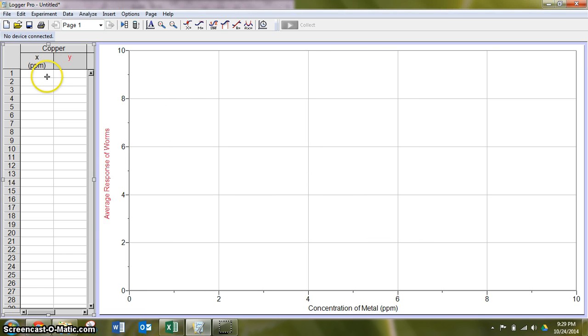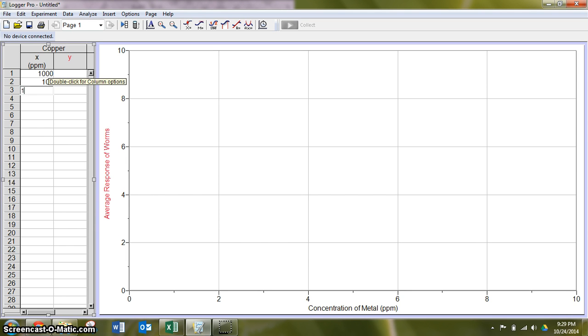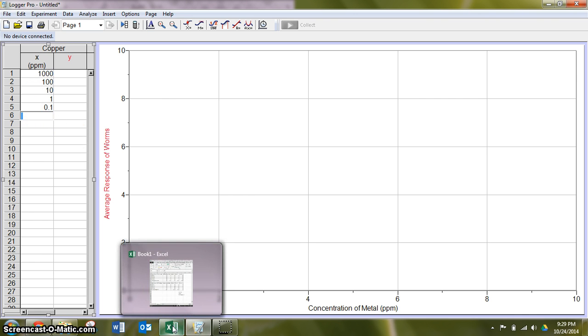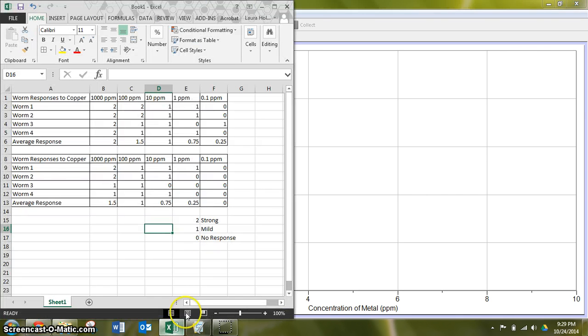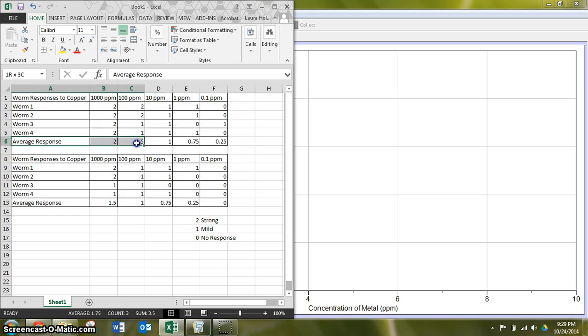So like before, our concentrations are powers of 10. I'm going to take us back to the exact same data table. And this time, we are going to take a look for our average responses.